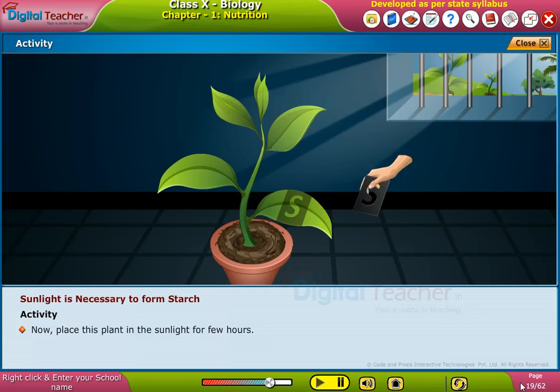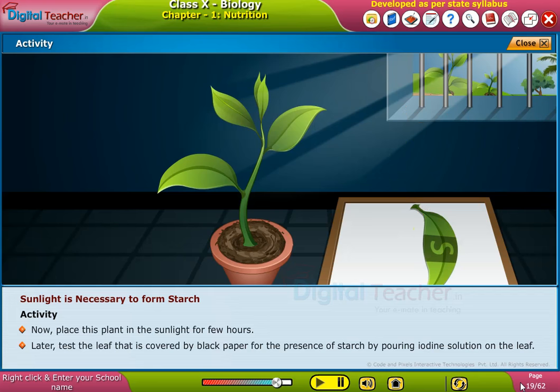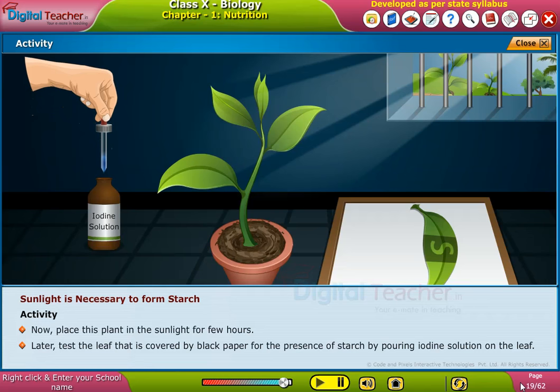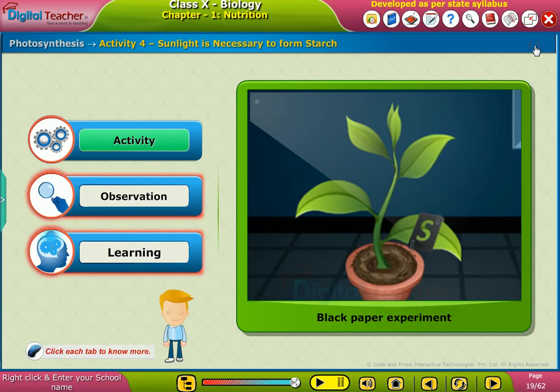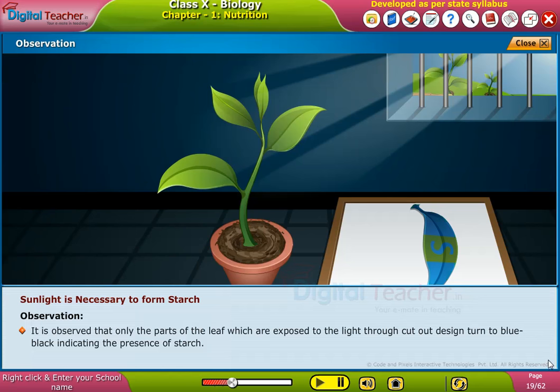Later, test the leaf that is covered by black paper for the presence of starch by pouring iodine solution on the leaf. Observe the changes in the leaf. It is observed that only the parts of the leaf which are exposed to the light through the cut-out design turned blue-black, indicating the presence of starch.